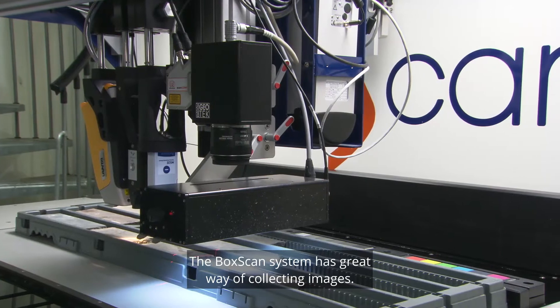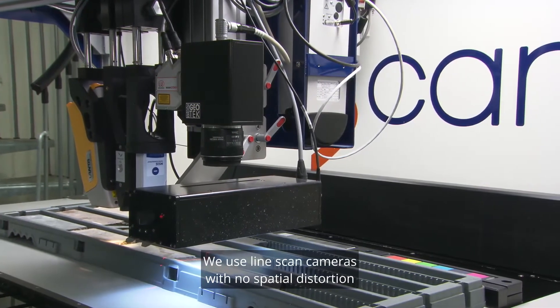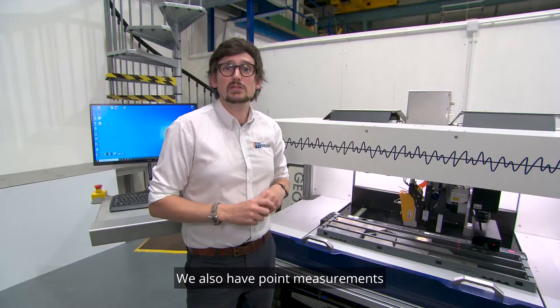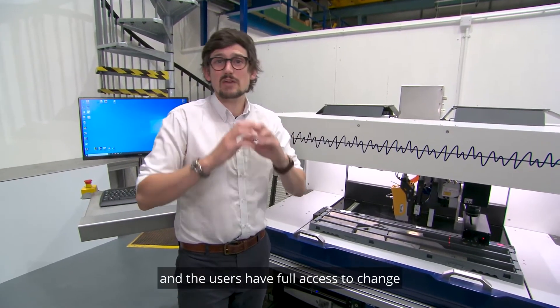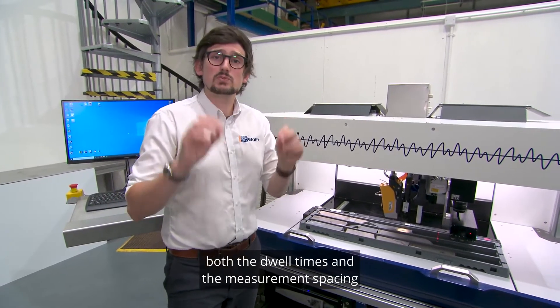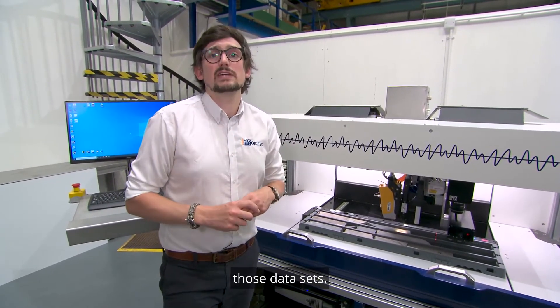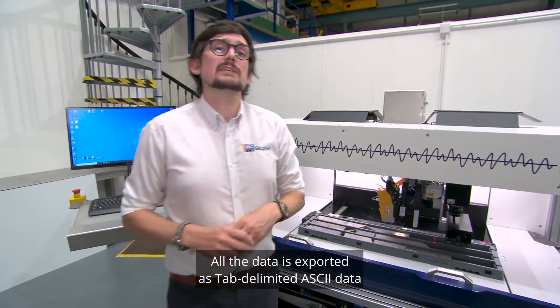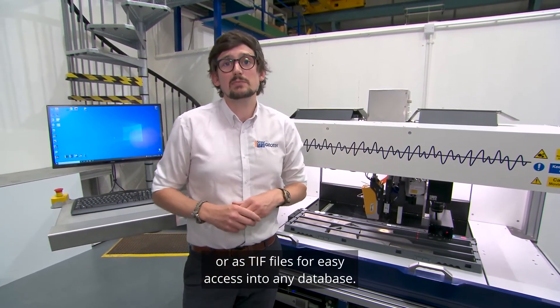The BoxScan system uses line scan cameras with no spatial distortion of those images. We also have point measurements with depth co-registered data, and users have full access to change both the dwell times and measurement spacing of those datasets. All data is exported as tab-delimited ASCII data or as TIFF files for easy access into any database.